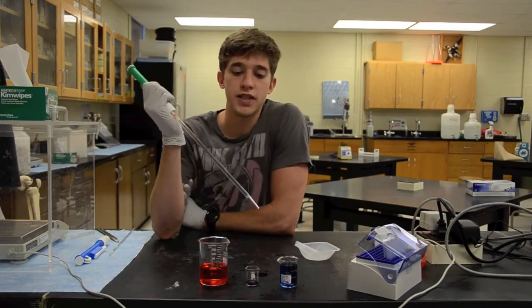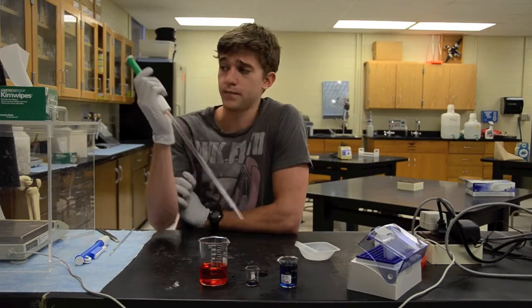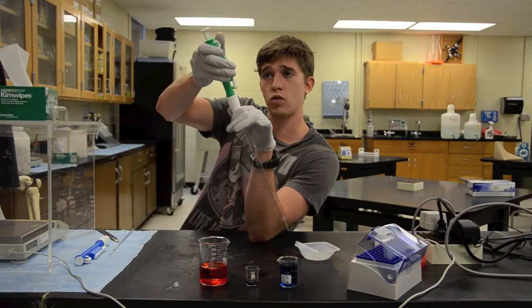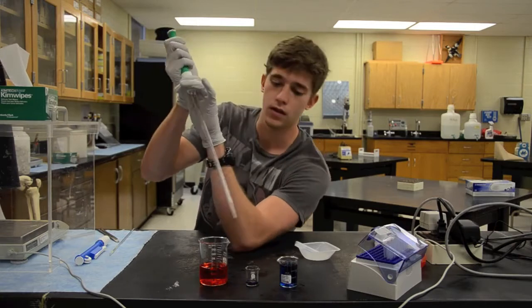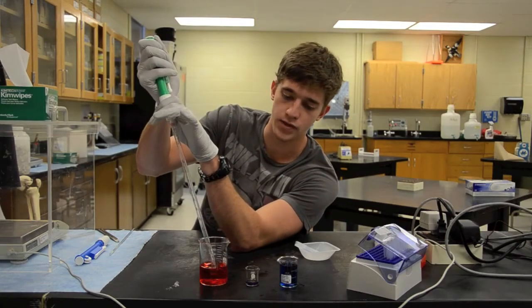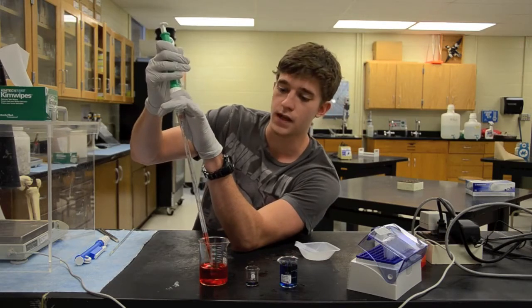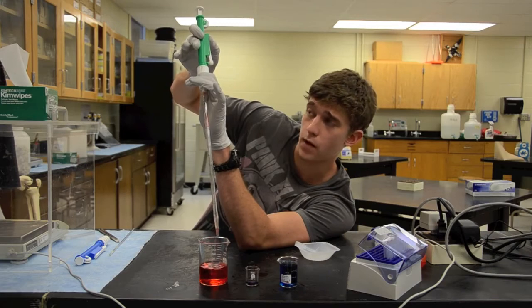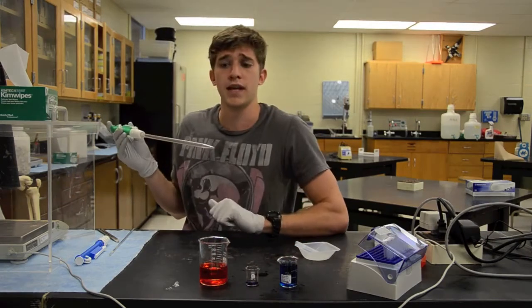Now, when you decide you need to start picking up your liquid in order to dispense it into your new solution, all you're going to need to use to pick it up is this little manual roller right here. It's going to take your solution. You stick it in there, and we roll it up. We'll pick up solution. Now, to dispense it, all you need to do is press this side here and the liquid will come out.